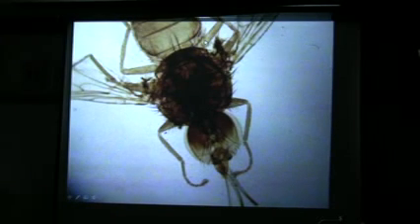Okay, what is that stage? Pupa, and look at the eyes. These are the compound eyes developing. Okay, ooh, this is huge. What is the name of the organism? Glossina. Yeah, this is Glossina. Transmit what?